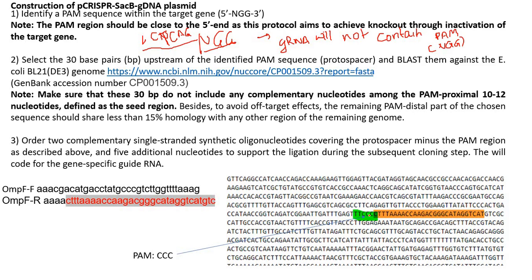You just count it, and as you can see, CCC TTT AAAA, you can match it; it is highlighted in orange and marked in red. It goes all the way around to CATGTC.